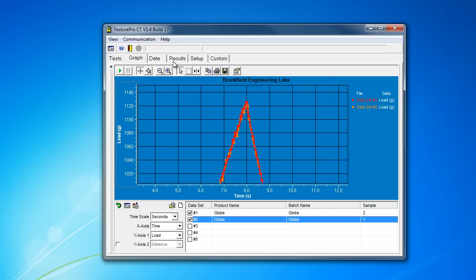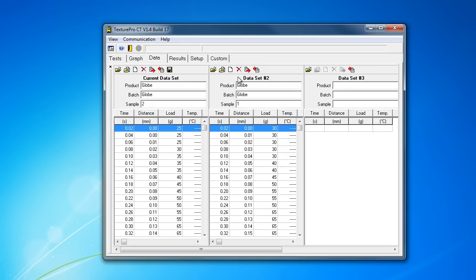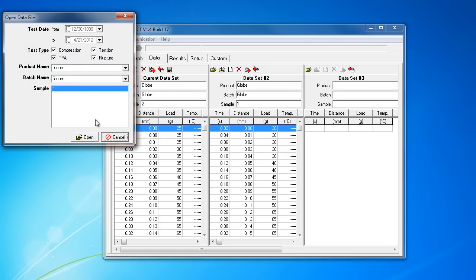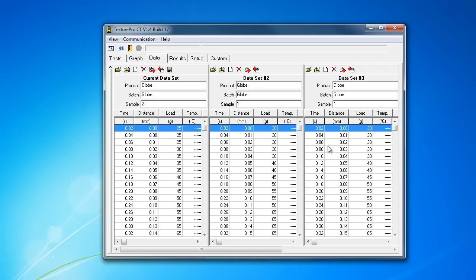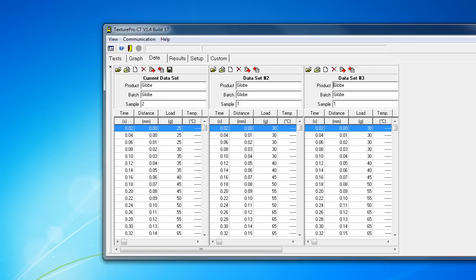The ability to import and export files is done one by one. It's not designed to handle multiple tests. Not only is loading five replicates into the software a pain, as you need to do one by one, but the software can only handle five replicates at once.